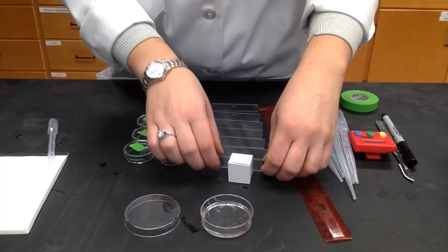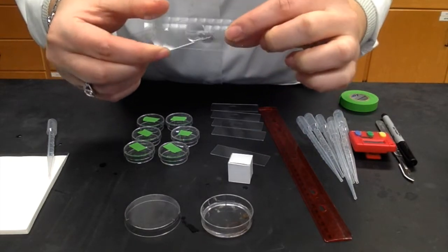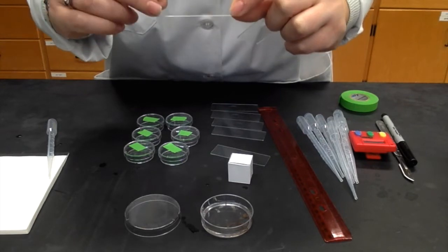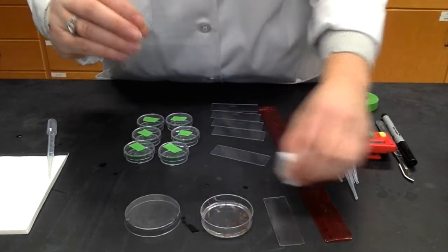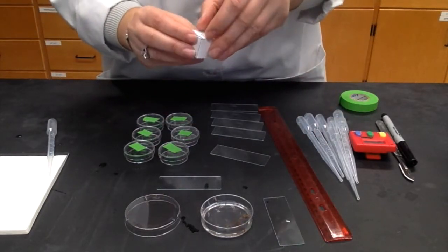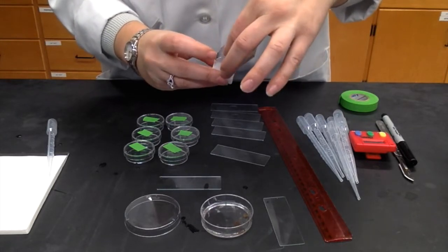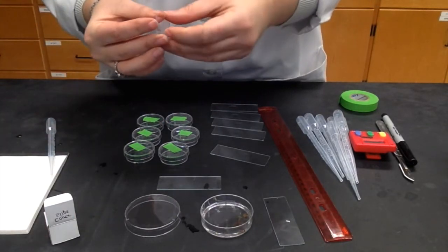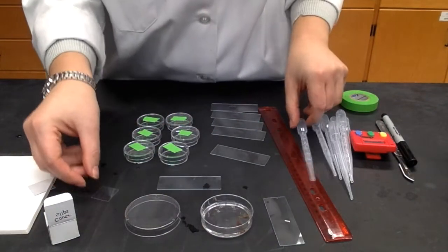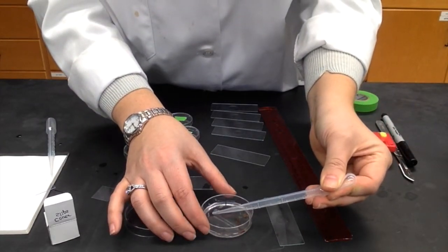You have 2 types of slides you're working with. One slide has a depression, a small ring, and the other slide is a completely flat glass slide. This is your workspace, your operating table for the worms. Don't use a scalpel to cut the worm. Instead, use a cover slip. Each station will have a box of cover slips. Separate out 1 cover slip and use a transfer pipette to suck up one of the worms.